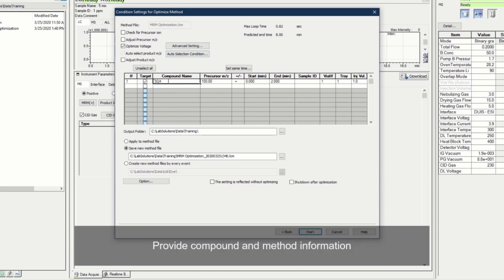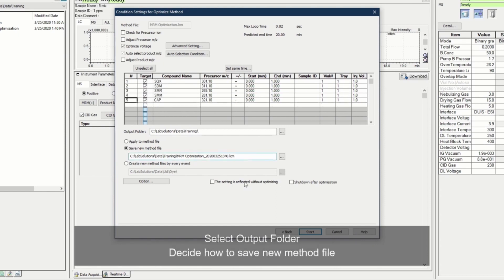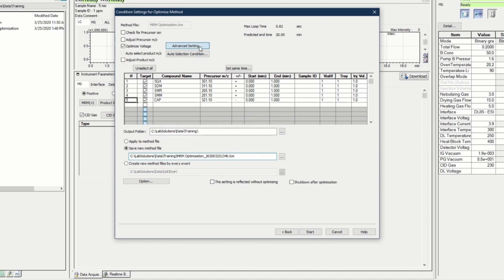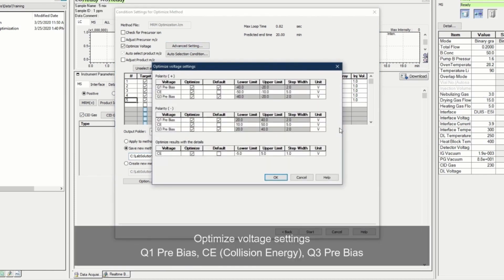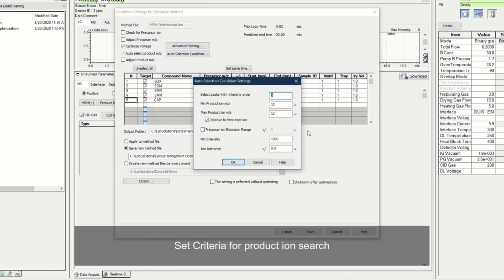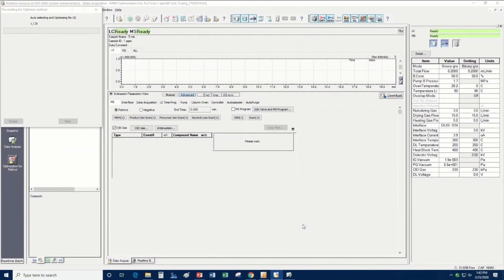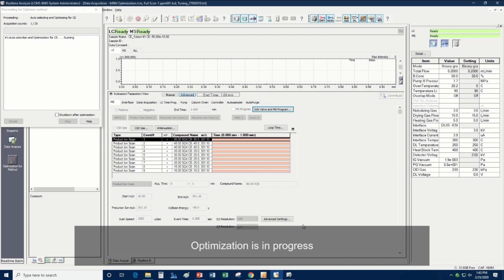Enter basic information of the five veterinary drugs into the table. Don't forget to indicate the position of your vial in the table too. Select the output folder where your method file will be saved — all optimized MRM transitions and parameters will be automatically saved to this method file when optimization is completed. You may edit the parameters to be optimized or the product ion selection criteria. Press the Start button when all are ready.